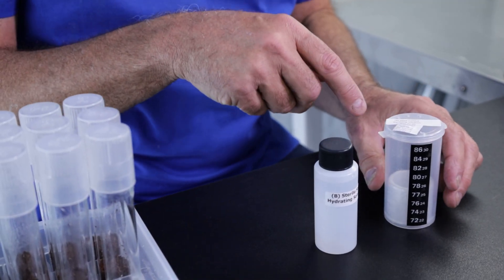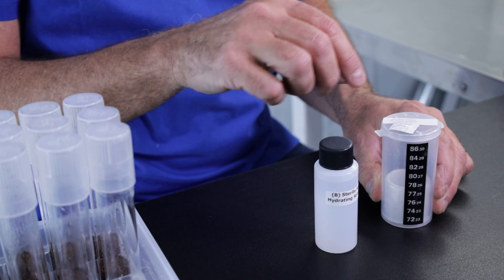Here are the pieces that make that work. We have a sterile hydrating solution. This is part B.